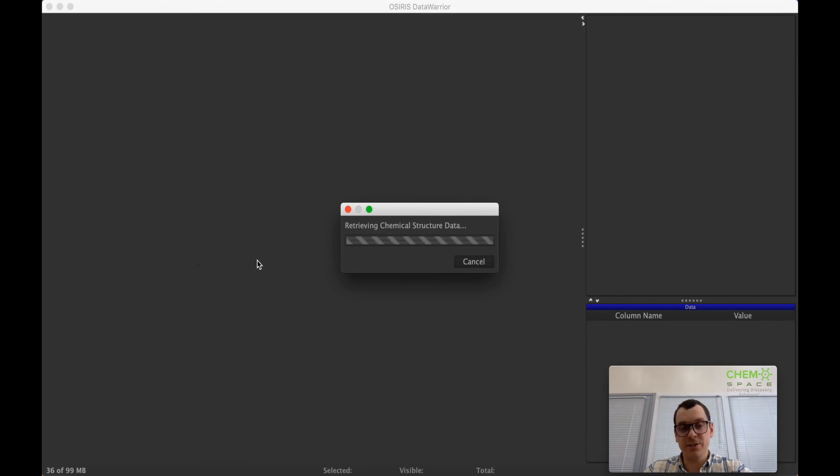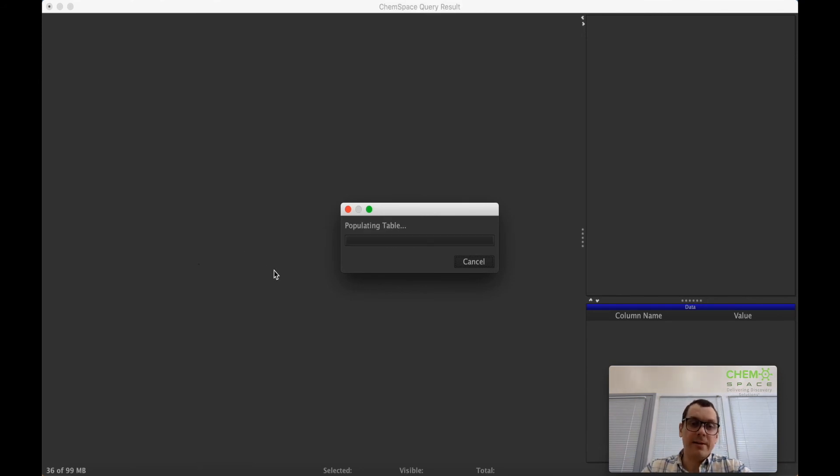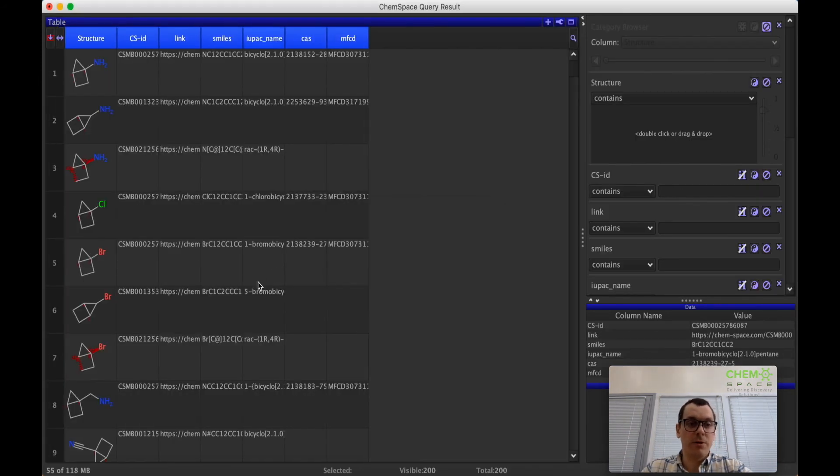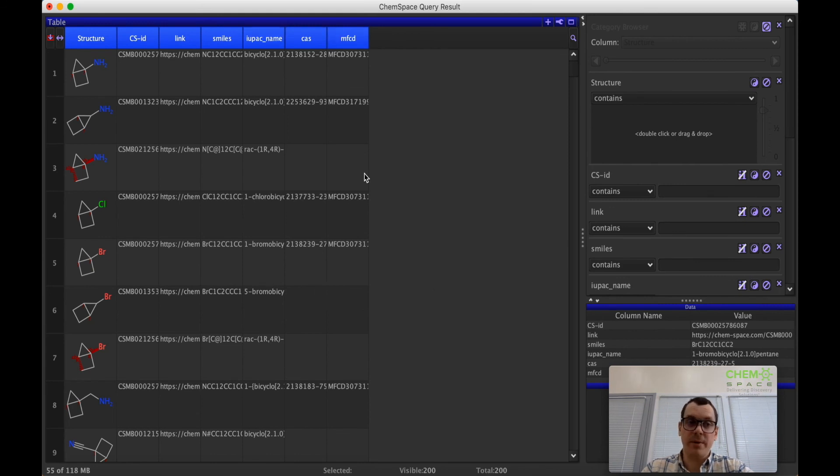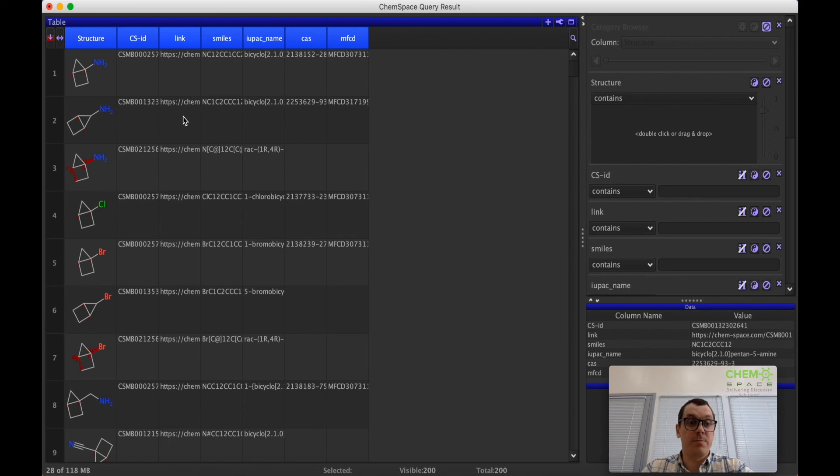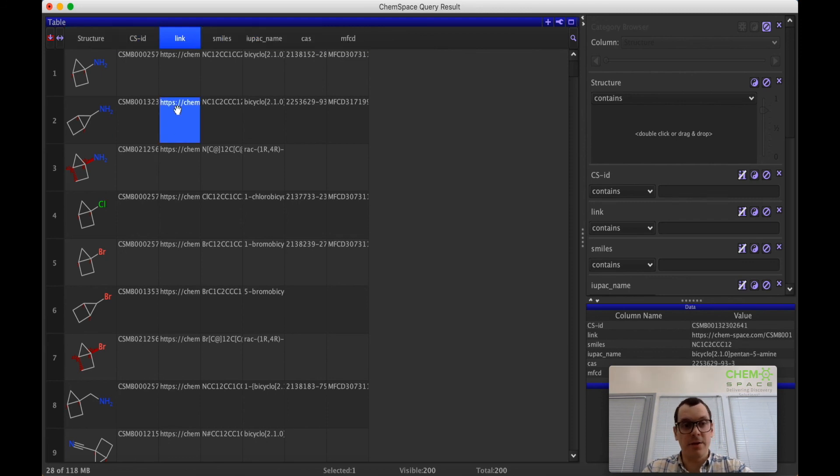And within just a few seconds you can get access to the molecules with the selected substructure available through ChemSpace, and if you really want to proceed with purchasing them you can just use this link here.